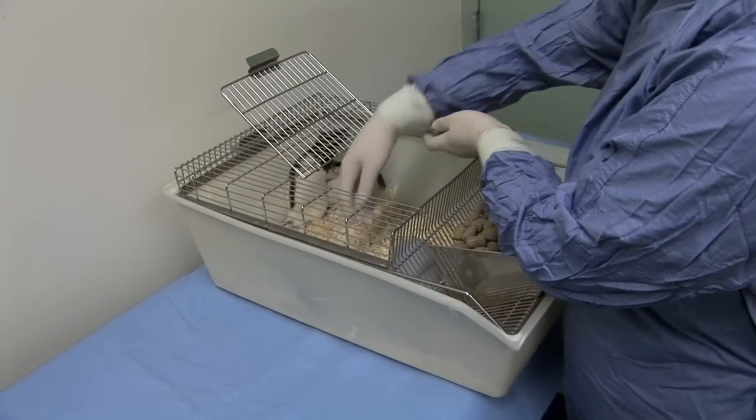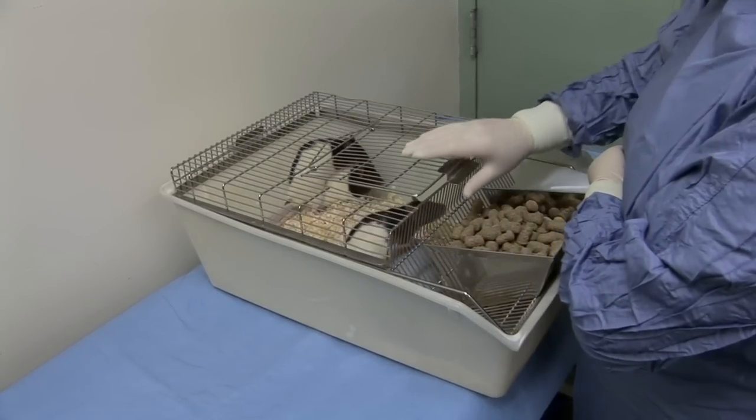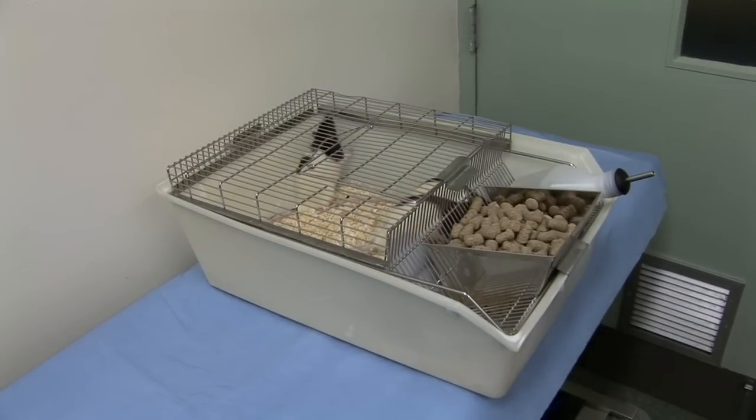When releasing the rat, maintain a secure grip until its feet have made contact with the cage floor, then gently release it.